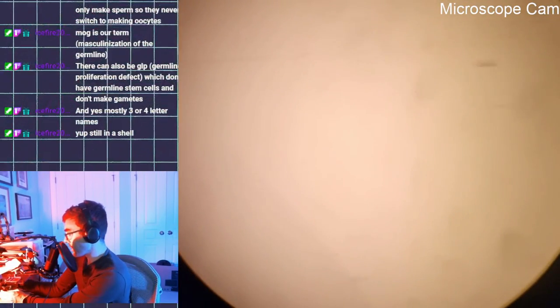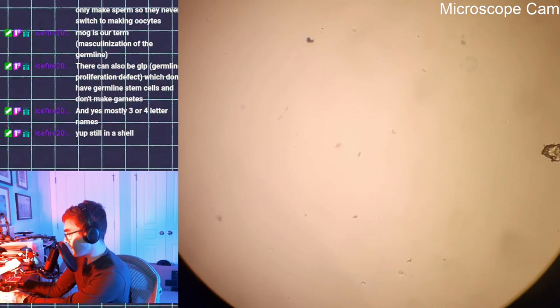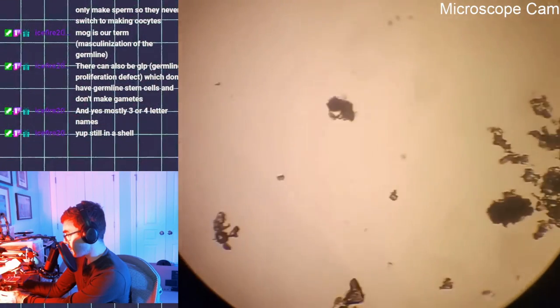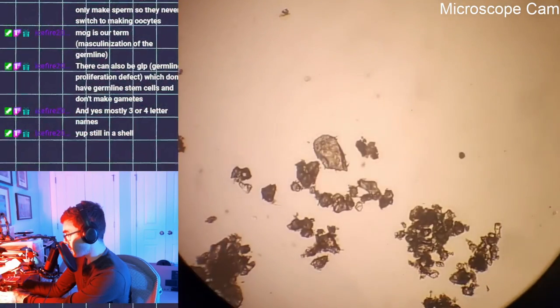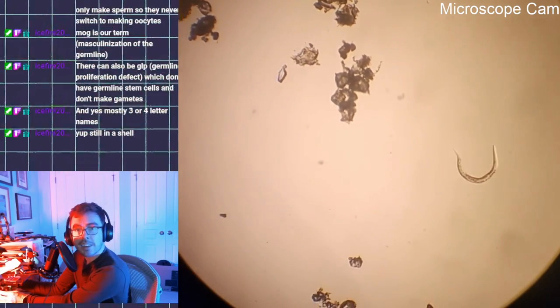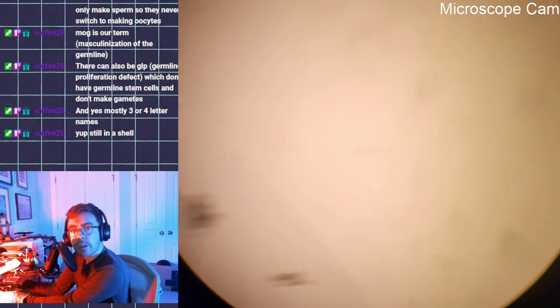So now it's under a cover slip. If I find them and they stay put, I can go to the highest magnification. And that's assuming I actually grab them. I guess I should go less magnification. They're pretty big. I hope they weren't too fragile that the, oh, a worm. Might have been stuck in the pipette tip, or it was actually in the water. I just didn't know it.